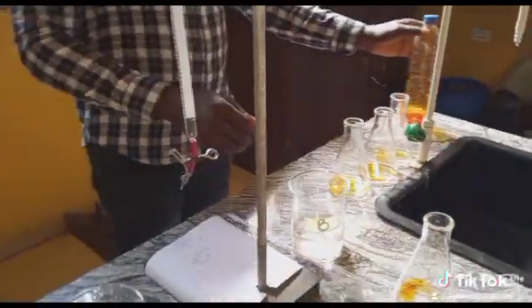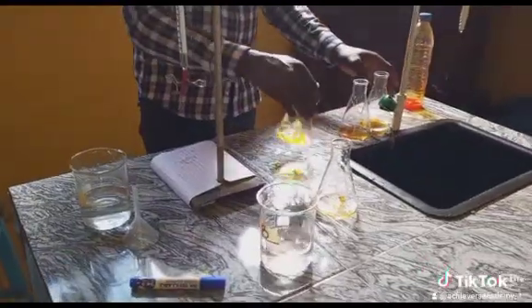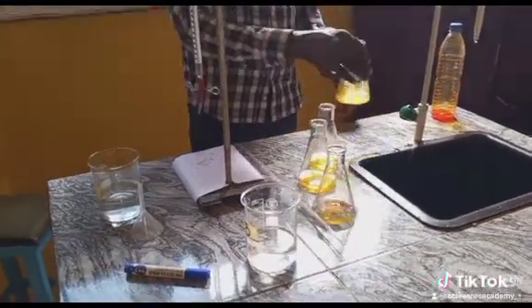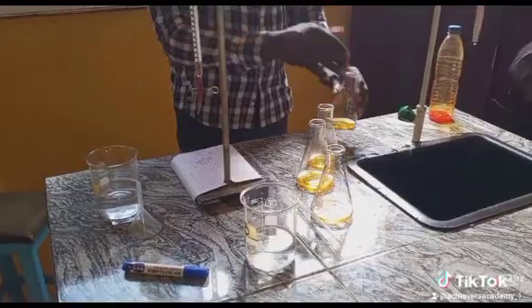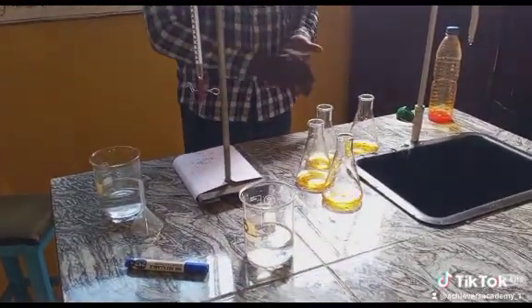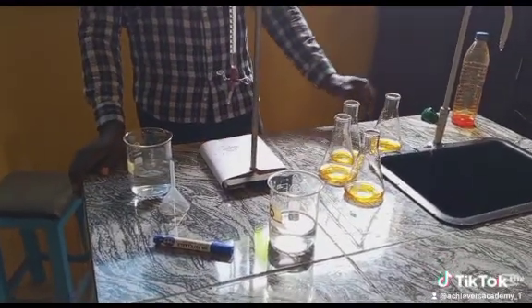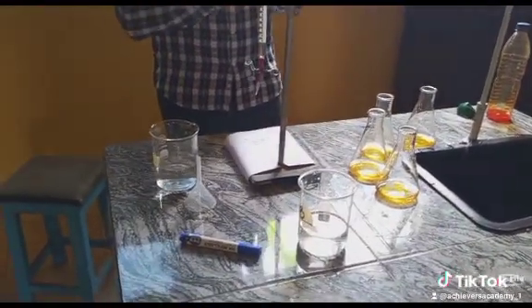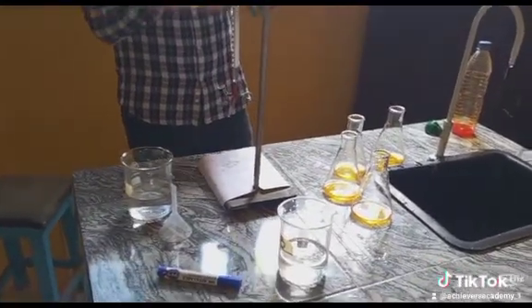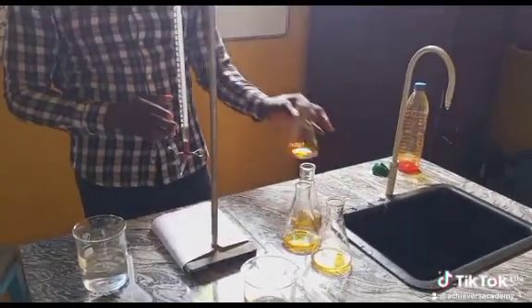Okay, now I think we are done with that exercise. You can shake. What color do we have? What is the color of methyl orange in the base? Yellow, right? Now we can start with the first titration. This is rough. Now, like I told you last week, we don't assume anything. We don't know the volume of the acid that will neutralize the base. So what do we do? We take it drop by drop.